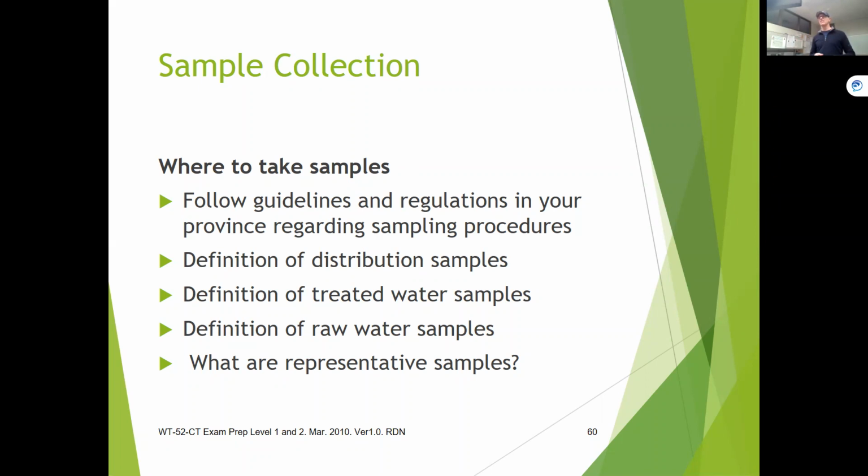You're also going to make sure you're taking samples of your raw water. For us here, because I have a lake and a creek, I'm going to be taking samples of those. I'm going to take samples of the water leaving this plant, and I've got two major extremities that I'm going to look at. So I'll make sure that I take samples from there, but also in between, to make sure that I'm getting representative samples.